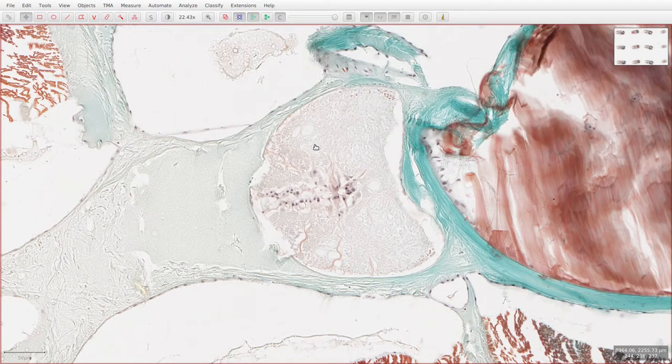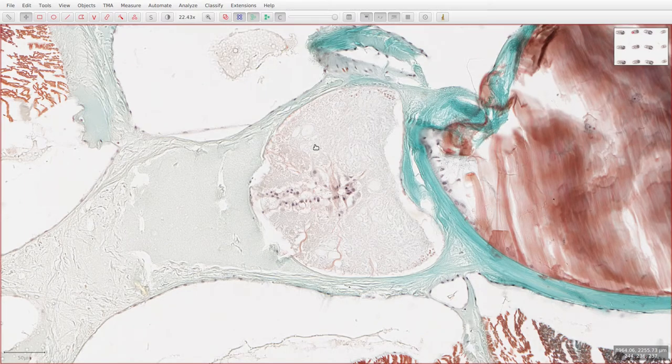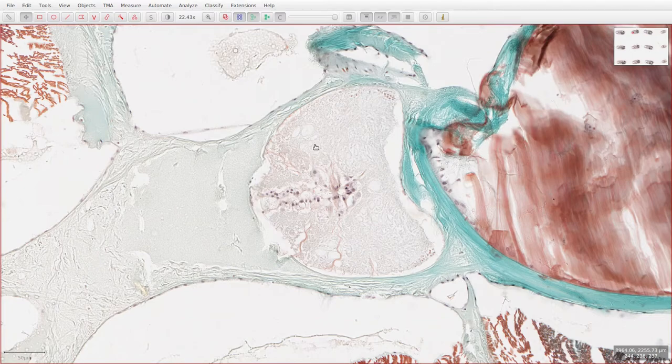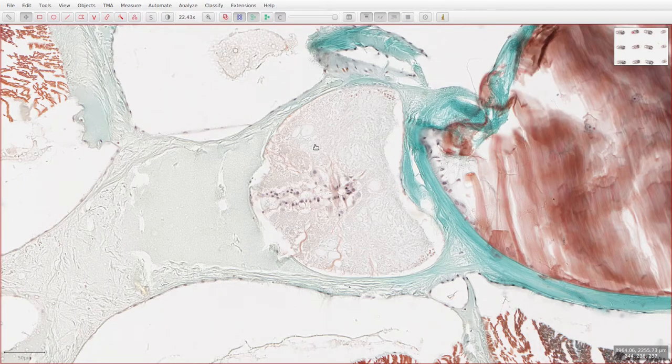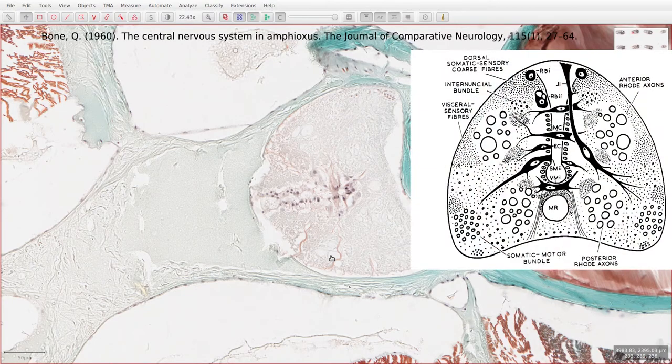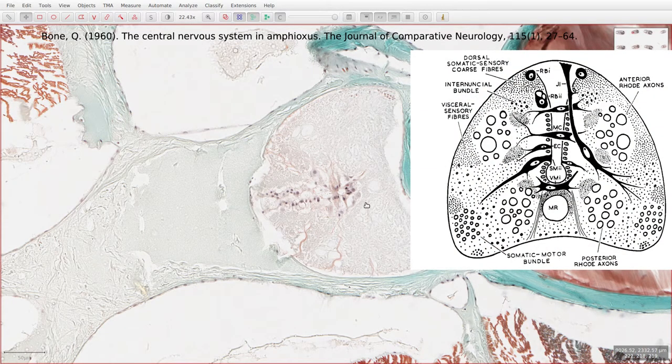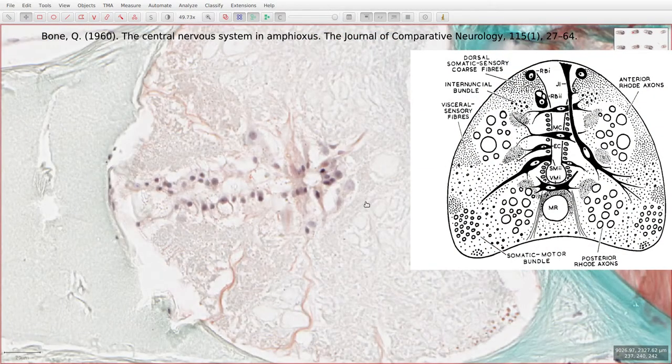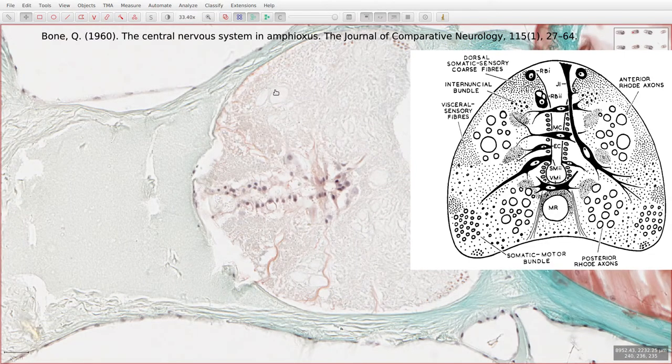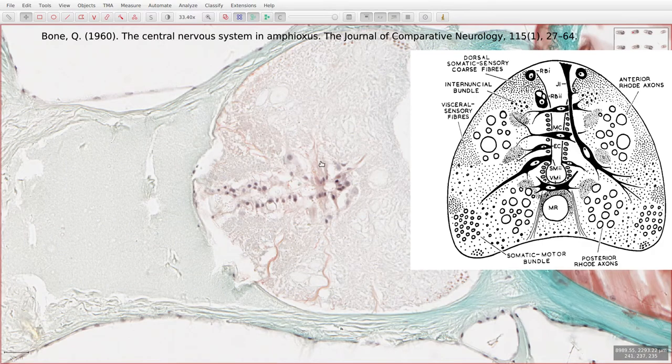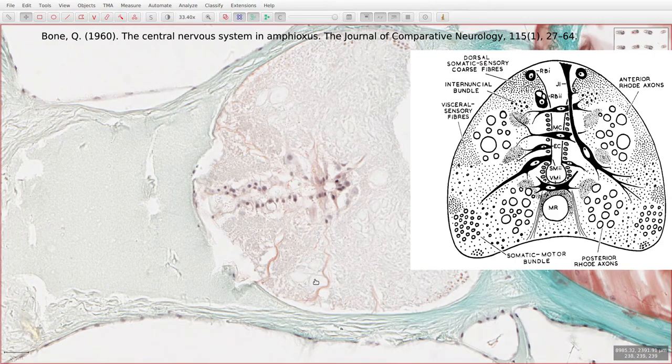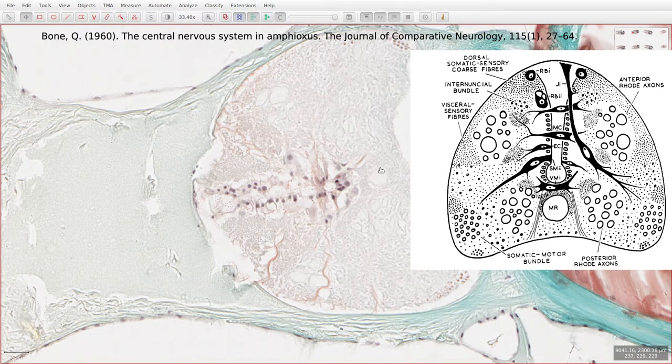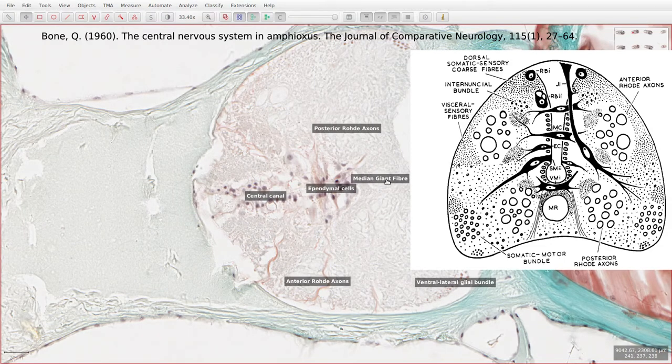Another kind of neuron which is often talked about in terms of amphioxus neuroanatomy is the Rohde cell or the giant motor neuron. I couldn't find any of these in the sections on this slide, but we can see their axons which flow down on either side of the dorsal spinal cord. So the axons are these large circles here, and you can see that it's bilaterally symmetrical. We have a bundle here which is replicated on this side, but also on this side there's a similar bundle of axons here, and then we have a large median giant fiber down the middle.